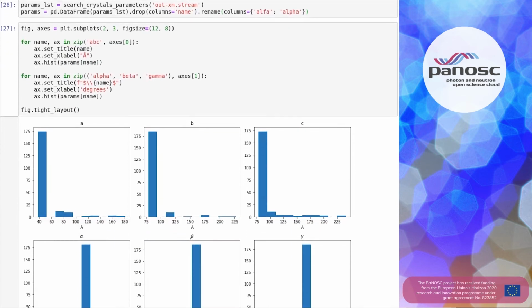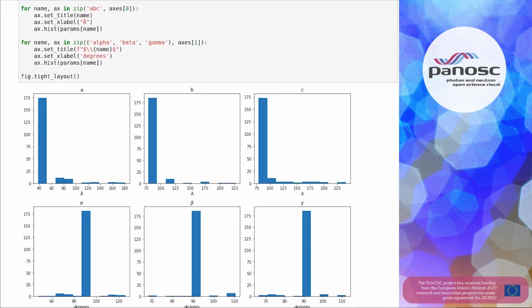These now look much messier. There's still a clear peak on the histogram where it's getting the right answer, the value that we'd expect, but there's also a scatter of results with very different values in each histogram. So even small changes to the data are already starting to affect our results.